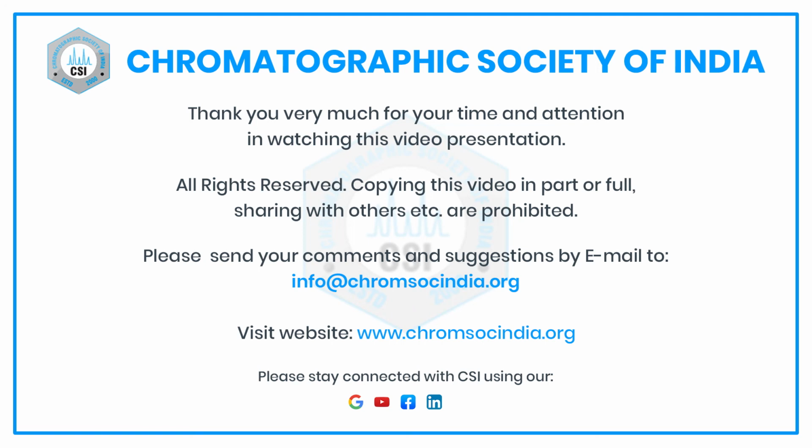So I will, in short, bring to you a summary of what we have talked about. Today we talked about electrospray ionization, which is a soft ionization technique applicable to low molecular weight and thermally labile compounds, and also very high molecular weight compounds, that is proteins and peptides, and non-volatile compounds. If you have non-volatile compounds, they are good to work on ESI. Some of the low polar compounds will not work on ESI, so you need to put a little bit of heat on it, and then you have the APCI interface. I have discussed the APCI interface with you.